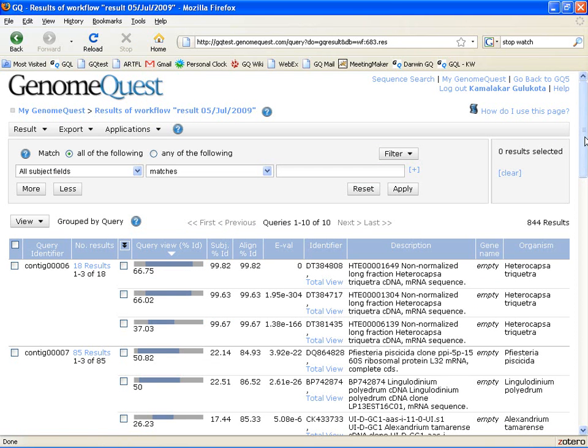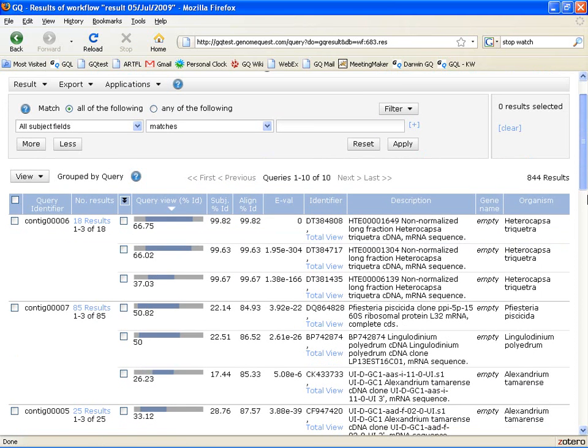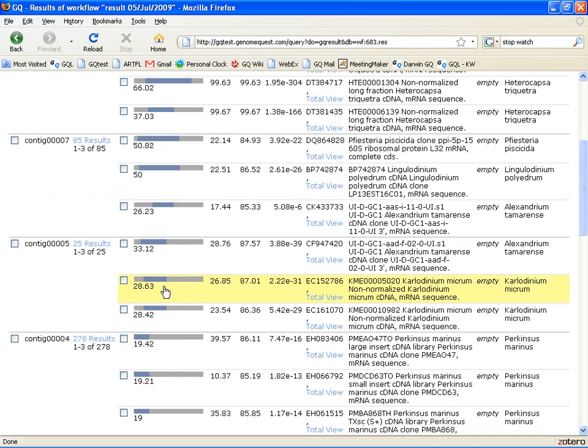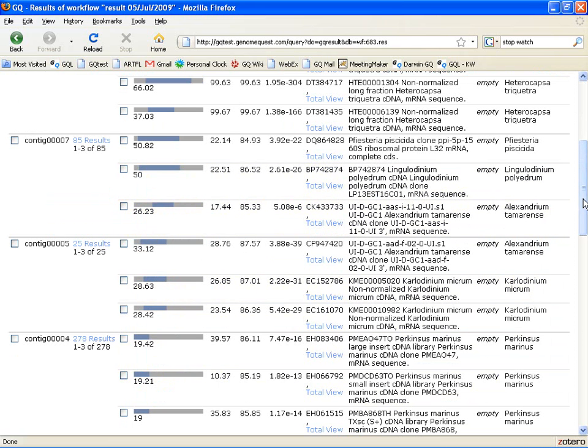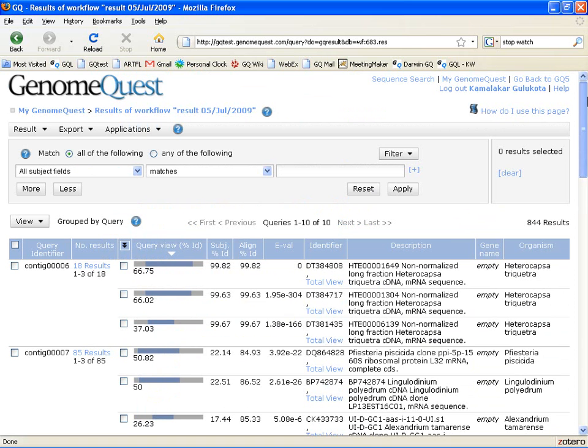I'm not sure I'm convinced though because some of these matches at 26% and 50% and 19% even don't sound too convincing. Now, GenomeQuest shines in being able to help you make sense of these results.